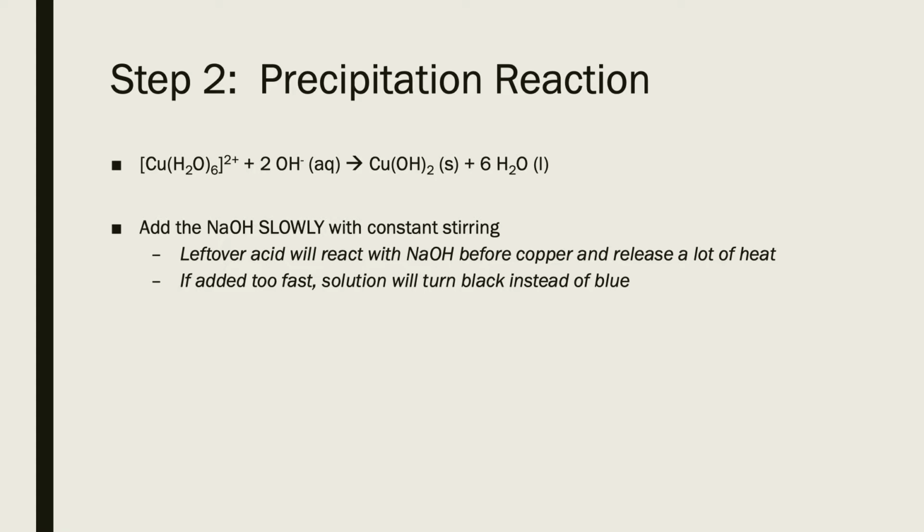And you want to do this relatively slowly because, since we just used nitric acid in the previous step, sodium hydroxide and nitric acid can do an acid-base neutralization, and those reactions give off a lot of heat. And so that can heat the solution up a lot, and you want to be careful because that might turn your solution black instead of blue in color, and it's going to be a little harder to tell when it's done right.